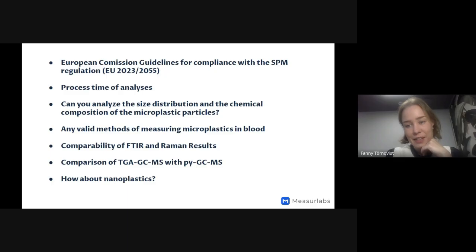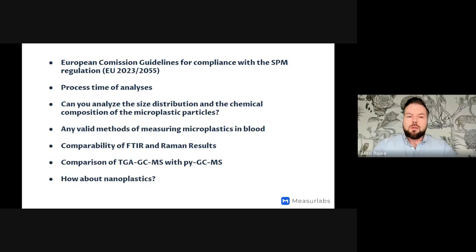Then Danielle is asking about tissue and blood samples, and is there some pre-sampling step or prior steps before pyrolysis GCMS? Yes, there is a quite similar method that is used for the other matrices.